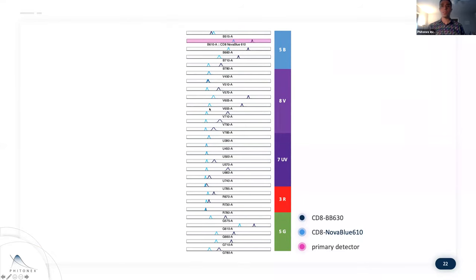But notably, it's incredibly quiet in the violet, right? And has much less cross-excitation than the green. And so, while it might be a dim label, it's incredibly cleanly emitting. And so you'll see, I'll present these plots in this fashion, where we've got all of the blue detectors, violet, UV, red, and then the number of detectors off the green.